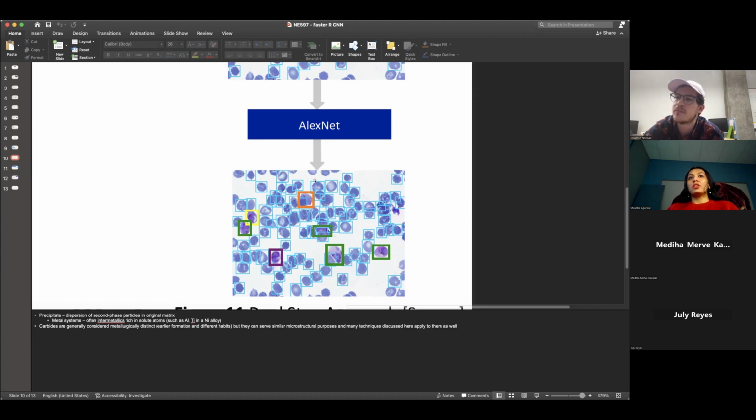Absolutely. If there was a shortage of data, I would prefer techniques like data augmentation. Yep, data augmentation was done in this data set as well to try and improve the data set for the non-red blood cell cell types.